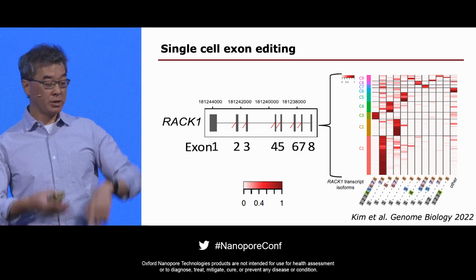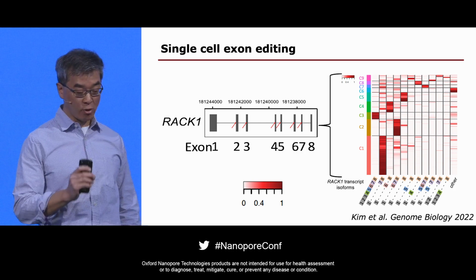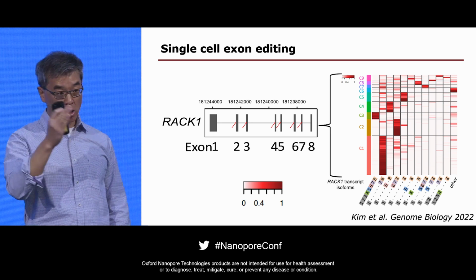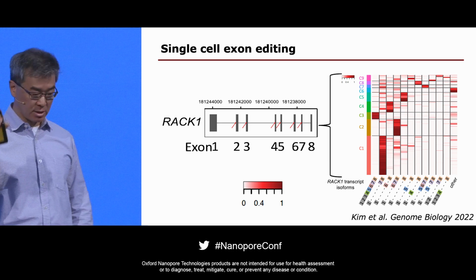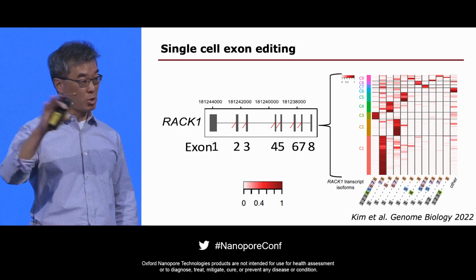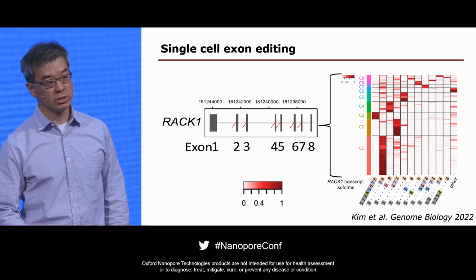What you're seeing on the right-hand side panel represents the transcript isoform changes. All of the cells are listed individually as rows, and the individual guide RNAs, because this is a multiplexed experiment done in a single culture, in a single tube, are all recognized immediately. So you can do this on a multiplex scale, intentionally introducing novel isoforms to see what they do.